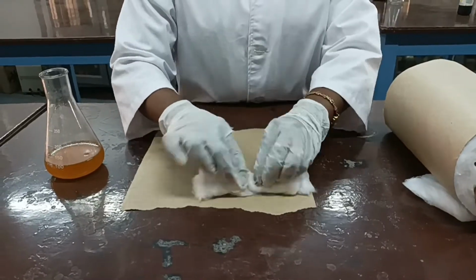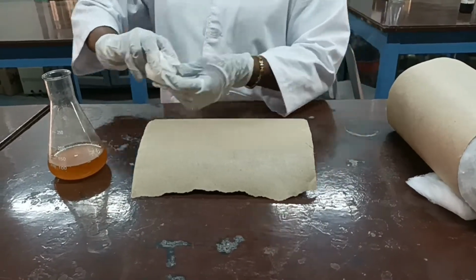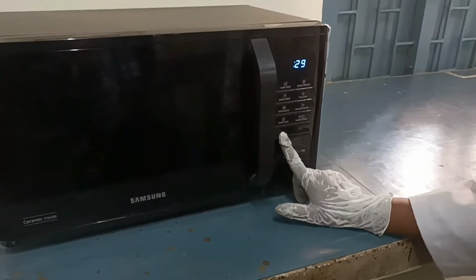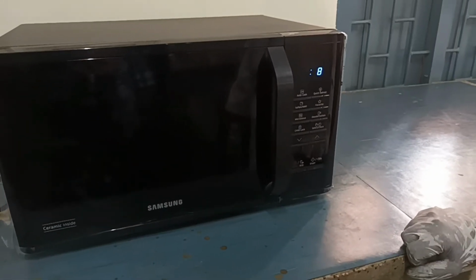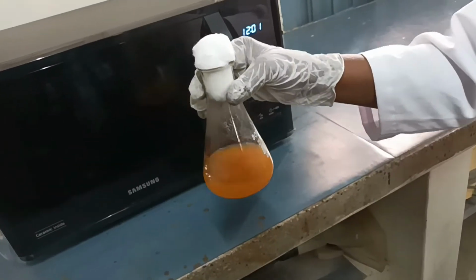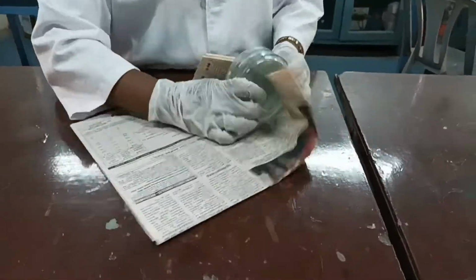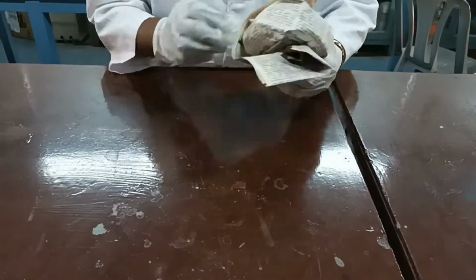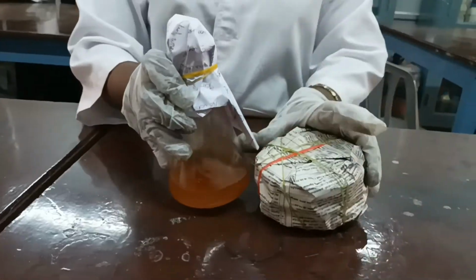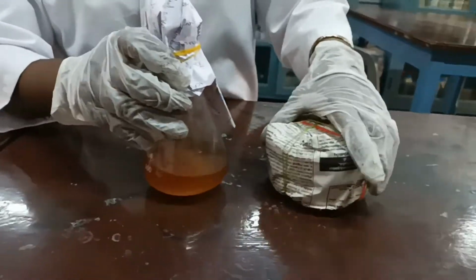After checking the pH, plug the cotton plug in the conical flask. Next, use the microwave oven for 20 seconds for proper dissolving of the nutrient agar medium. After finishing the process, wrap the conical flask and petri plates properly. Now the nutrient medium and petri plates are ready for sterilization.